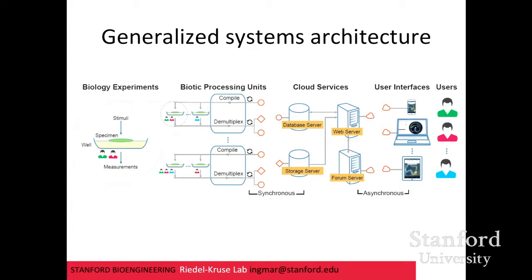From an architecture point of view, it's actually different from the Euglena system before, because the Euglena system was always a live system, with one user checking out one system and operating directly on it. While here you have an asynchronous mode where each machine is autonomously checking once in a while in the database whether there's something to do, and the user is also interacting with the database, putting the stimuli there and looking at recent data, but the user never controls any system directly.